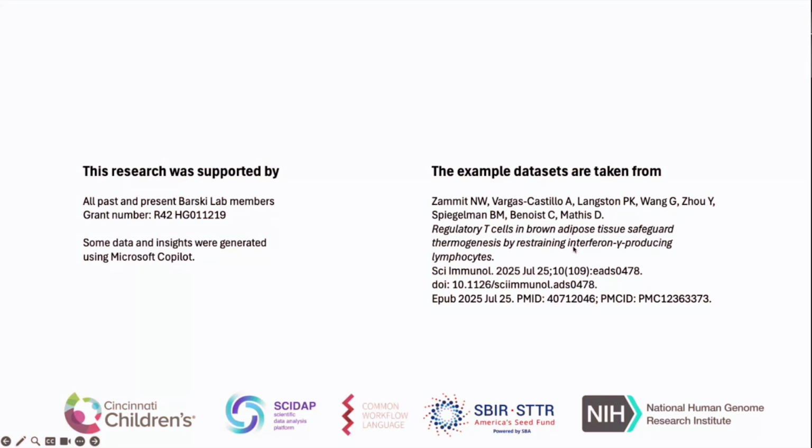As for using limma, I believe this is the safest way, because it only changes the normalized read counts that are used for the heat map after we already ran DESeq. I would be more careful with removing batch effects before DESeq, because it will change the values that go to DESeq, and in that case, we can make it worse.